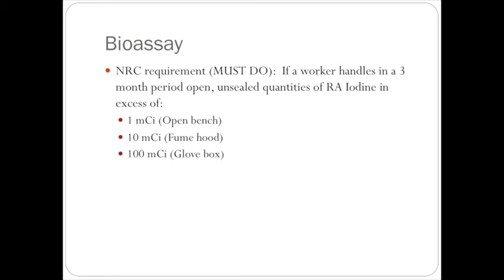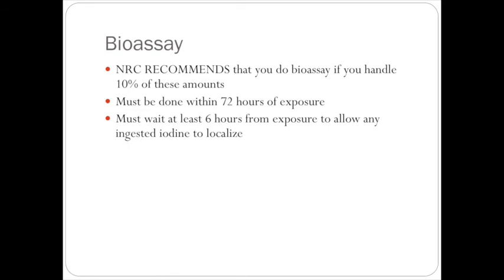Now, the NRC also recommends that you do bioassay if you handle 10% of those amounts. It's really not a hard test. It doesn't take long. And again, our goal is always to find a problem before it becomes a problem. And so most pharmacies will still have a routine bioassay procedure in place. In my last pharmacy, we did it even if I opened and never made iodine all week. I still did thyroid bioassay every week just to be part of the data collection point, so we could see if there were any trends that developed.